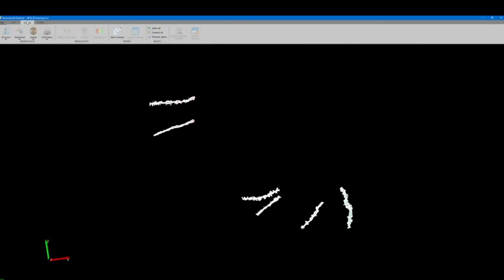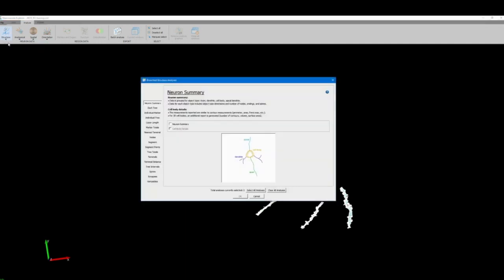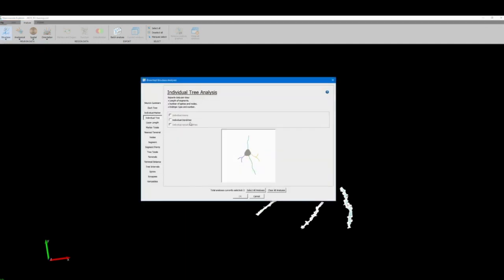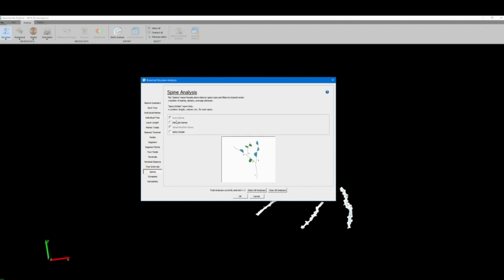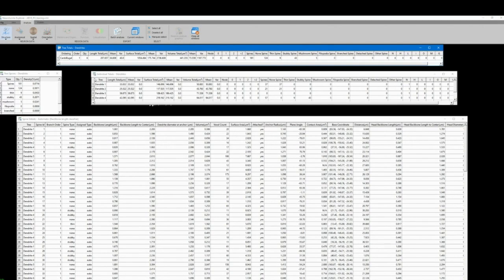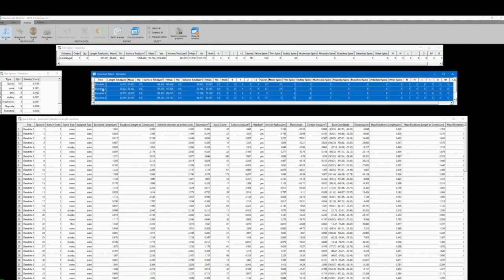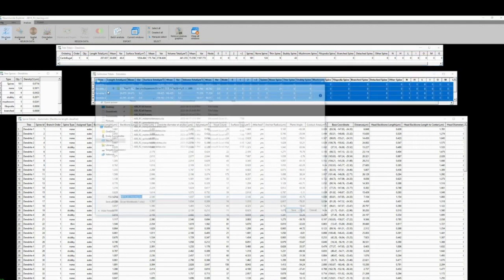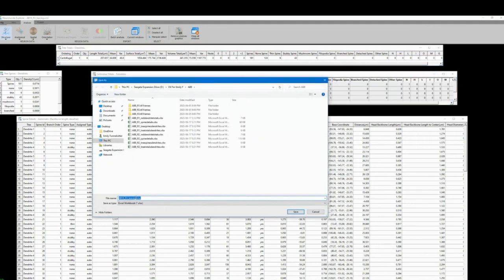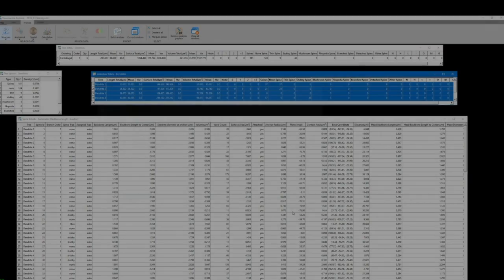We are now going to click on analyze structure and branch structure analysis. In the Neurolucida user manual the four analysis parameters recommended for dendritic spine analysis were individual dendrites, dendrite totals, dendrite spines, and spine details. Whichever parameters you do select will generate a fully formulated spreadsheet ready for export and further statistical analysis.